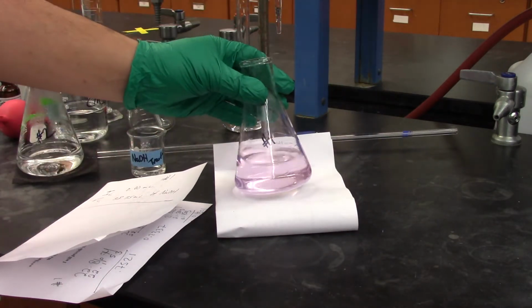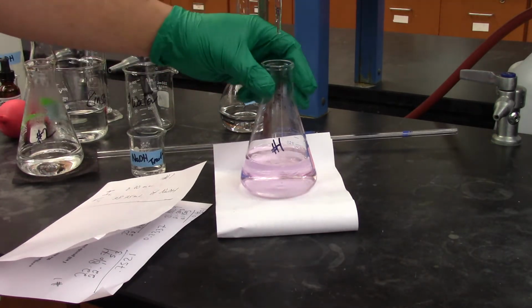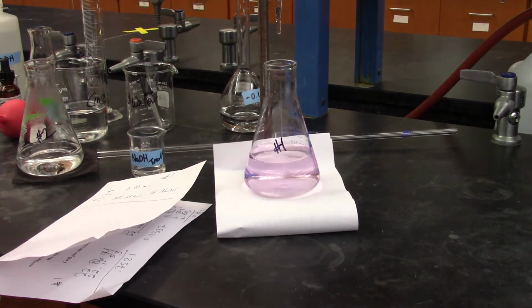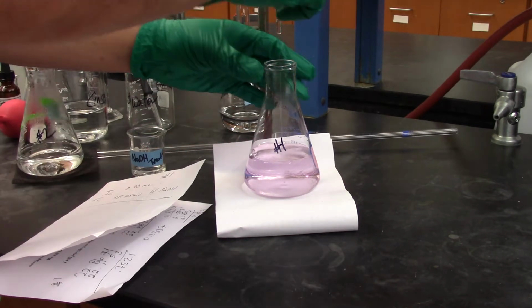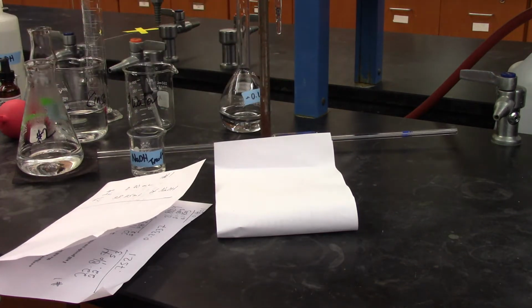Again, this is the color you're going to want to see. If I add more base, the color will eventually get more pink. It might be a little bit hard to see with the light, but it is getting a bit darker, and it's showing that that would be an over titration. So we want the faint colors there, okay? This is going to go to the waste, and then I'm going to get my next one up.